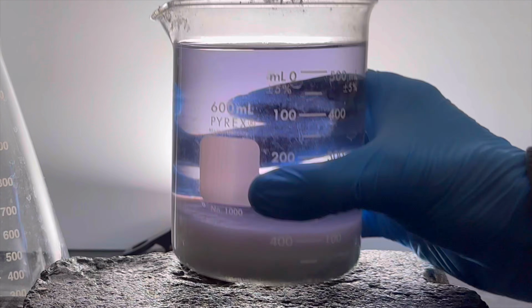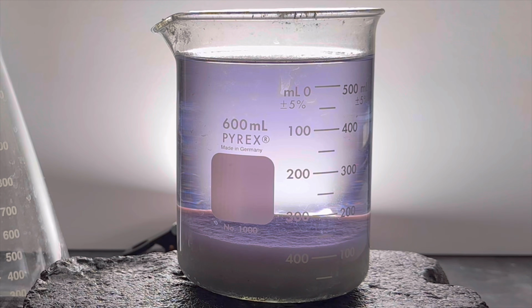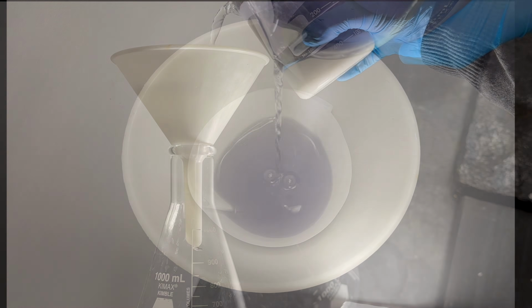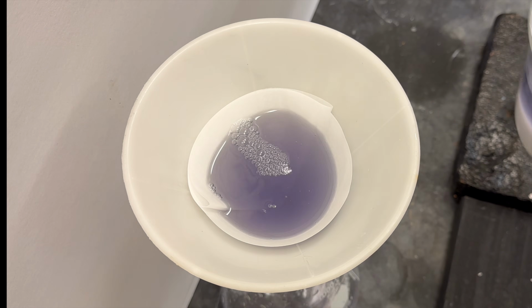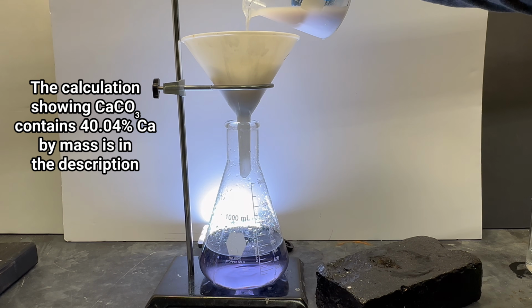This is what the mixture looked like after I let it sit for a few hours. It kind of looks like fallen snow beneath a purple sunset. Gives me new appreciation for the term precipitate, you know? Okay, now we're going to filter the mixture to collect the solid calcium carbonate and weigh it. And from this weight, we can figure out how much calcium was in the tooth. That's because calcium carbonate contains 40.04% calcium by mass.